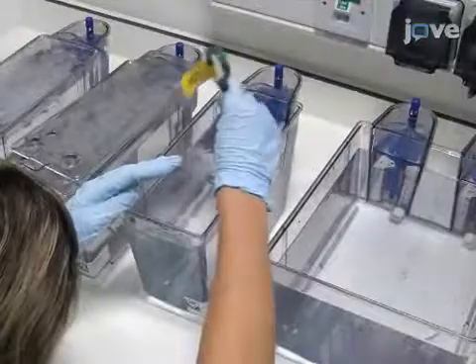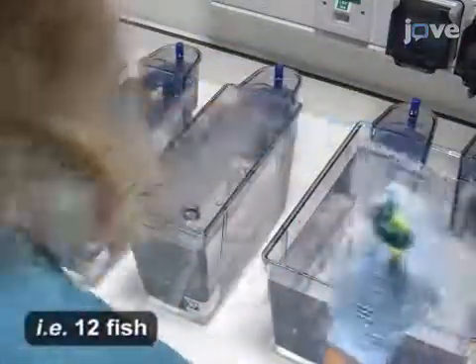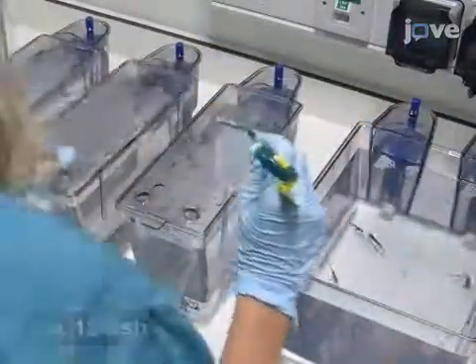Next, add 1-2 Danio rerio per liter, using wild-type fish of the dominant genetic background in the facility, for example AB. Select at least 6 fish.